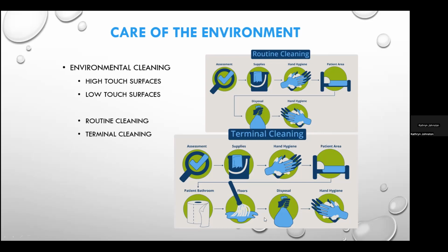And then as far as waste disposal goes, it's important to note that the waste should be placed in appropriate containers. So general waste should be in a regular bin. Infectious waste should be placed in the appropriate, color-coded or labeled bin for terminal decontamination and/or incineration.